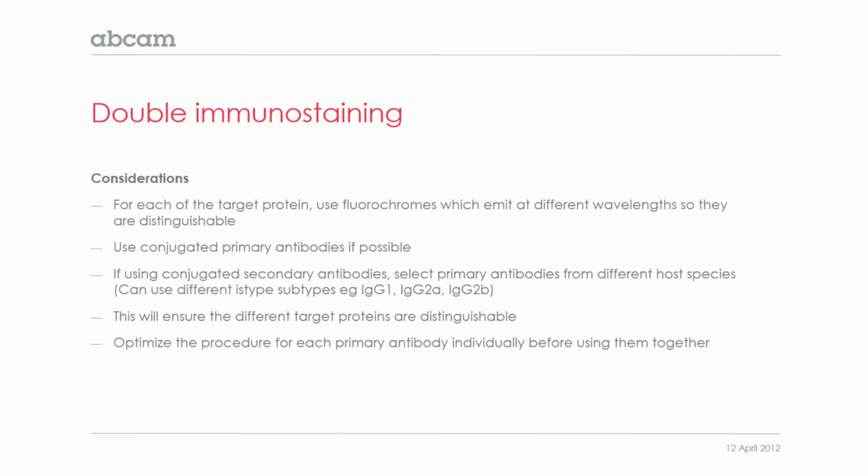You'll need to optimize the procedure for each primary antibody individually before you put them together, and we really would recommend to do this just to make sure that the reagents are working well and that the procedure is working well.